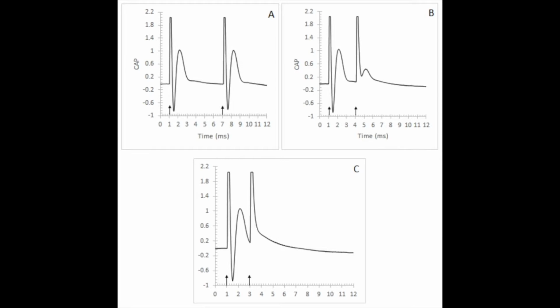For this experiment, a stimulus of 500 millivolts is assumed to be strong enough to generate action potentials in neuron fibers that are in the relative refractory period, a period where an action potential is more difficult to generate due to some sodium channels still being inactive and a hyperpolarized membrane potential. Thus, the refractory period here is defined by the delay between two stimulus pulses that is incapable of generating a second CAP, indicating that all neuron fibers in the nerve are in an absolute refractory state.